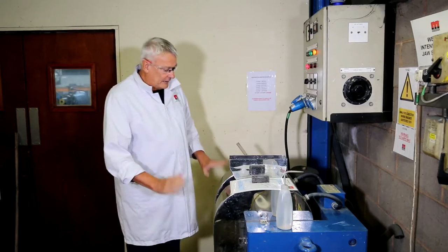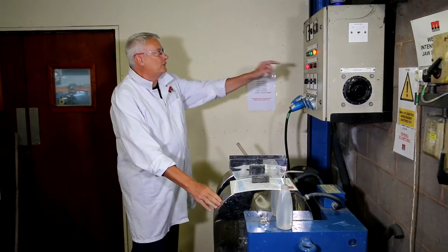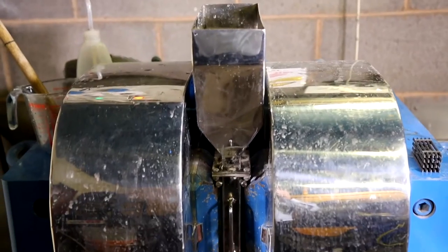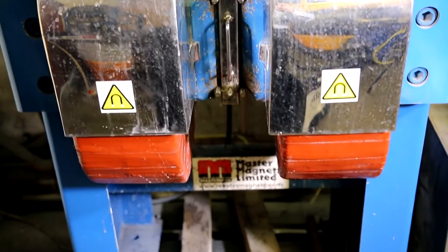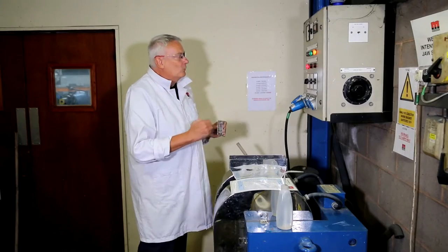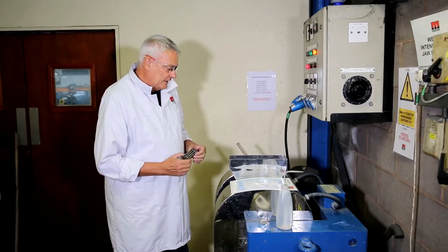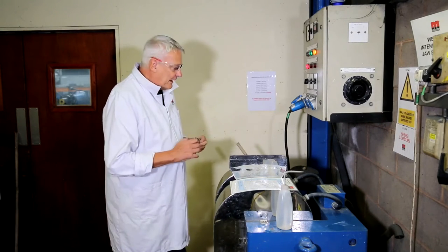What we have here is two copper coils powered by a transformer rectifier, and in the centre we have a gap where we put a matrix, which forms the holding part for the magnetic particles. The transformer rectifier will give us somewhere between zero and two tesla within the separating gap of the machine, which is enough to separate most minerals — so it's a very powerful machine.